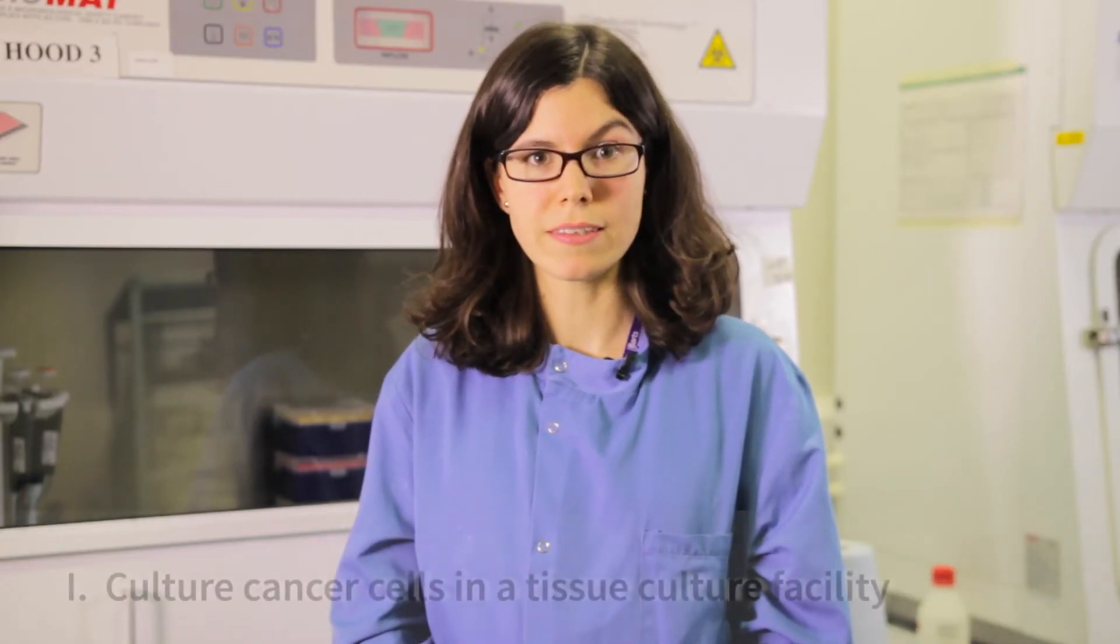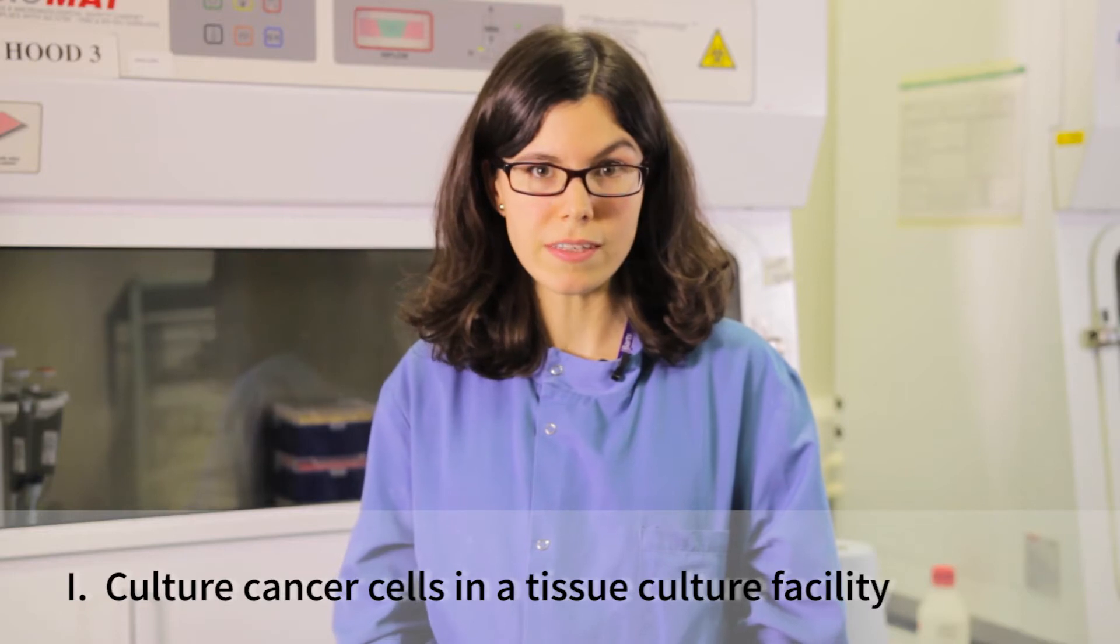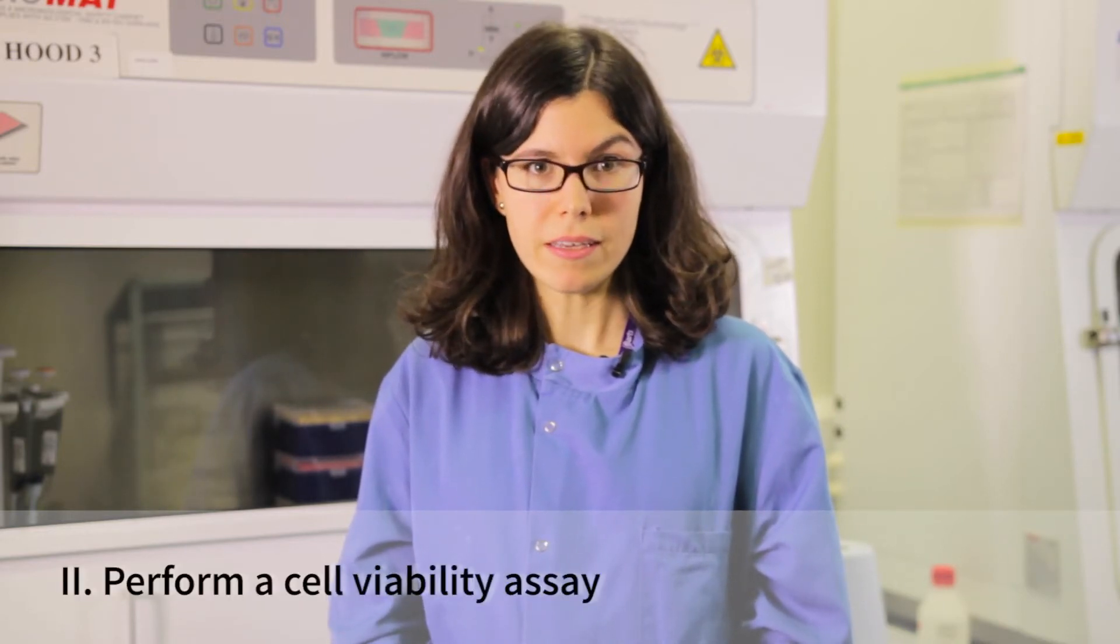In this video, I will show you how to culture cancer cells in a TC culture facility and also how to perform a cell viability assay, which are techniques that I normally use in my research.